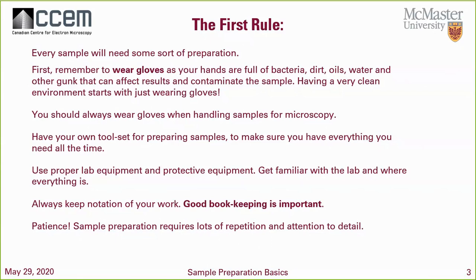You should always wear gloves when handling samples for any type of microscopy in general. And as a little tip for everyone, just get familiar with your environment, right? You have to get familiar with your lab, especially if you're a newcomer at that lab, and you want to make sure that you get your own tool set for that sample prep, or if you have a technician helping you, see if you can write down those techniques that the technician will show you.